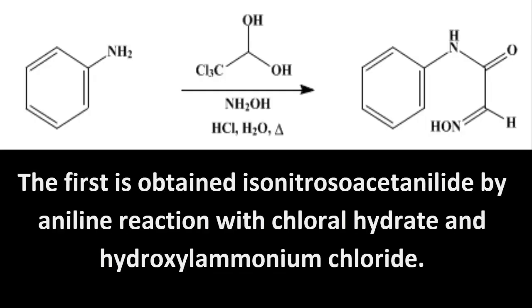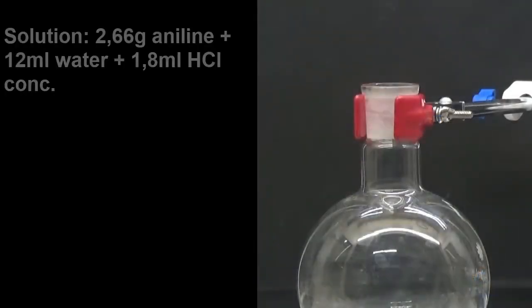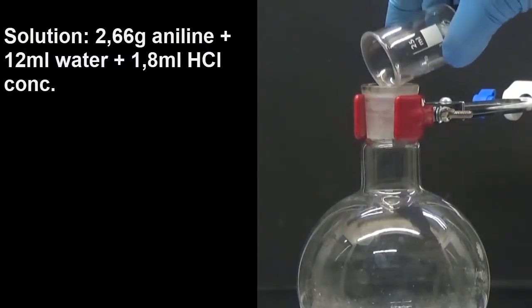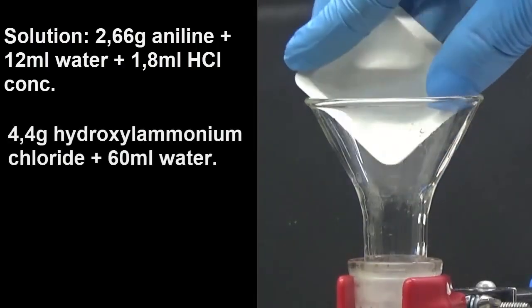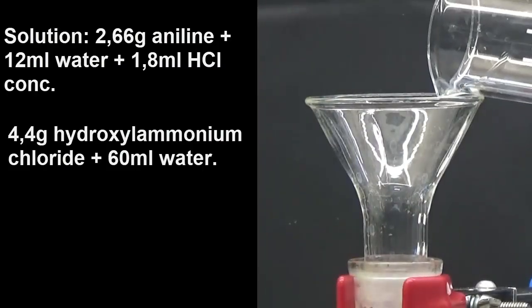The first is obtaining isonitrosoacetanilide by aniline reaction with chloral hydrate and hydroxylammonium chloride. To obtain isonitrosoacetanilide, blend into a 500 ml flask a solution of 2.66 grams of aniline in 12 ml of water and 1.8 ml of hydrochloric acid. Using a solid funnel, add 4.4 grams of hydroxylammonium chloride and 60 ml of water.